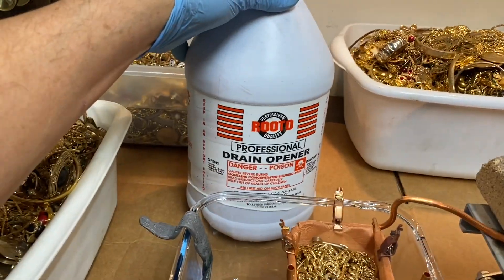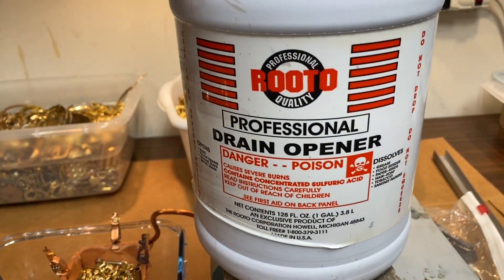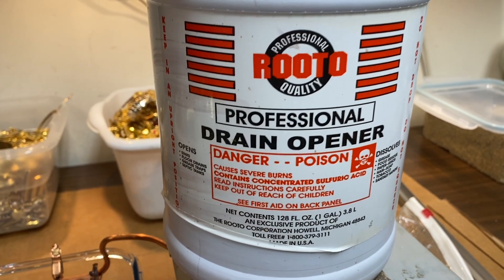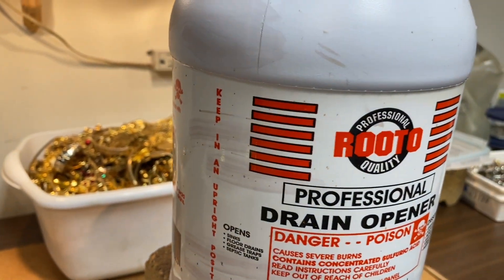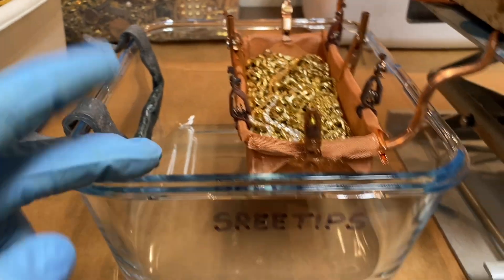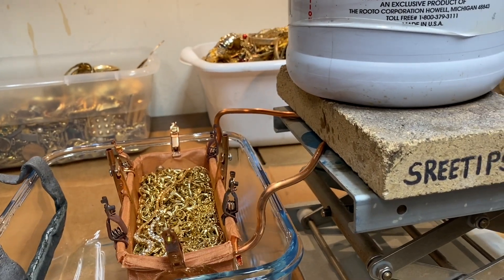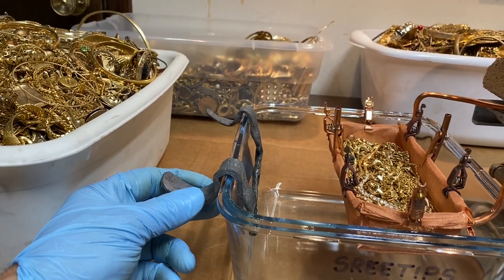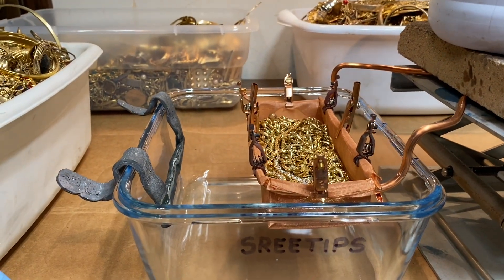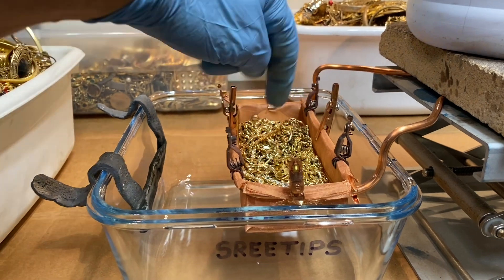Somebody was asking about what's in the drain cleaner. The drain cleaner contains 93% concentrated sulfuric acid — this is Rooto Professional Drain Cleaner, available at Ace Hardware. I think it's about $15, maybe $20 for a gallon of it. This is what I'll be using as the electrolyte in the cell — I'll just fill the cell up to about right here with this drain cleaner. Then we'll put the positive lead on this, negative lead on the cathode over here which is made out of lead, and lower the gold-plated material down into the electrolyte with the battery charger connected to it, and reverse plate all of the gold plating off of these pieces.